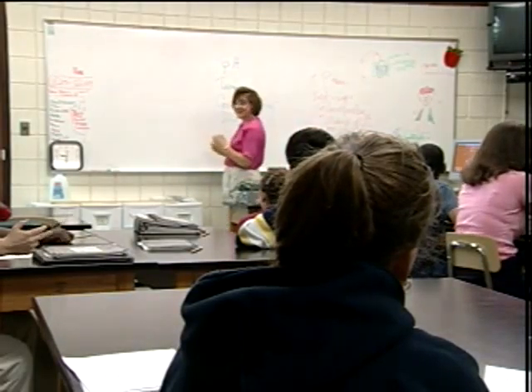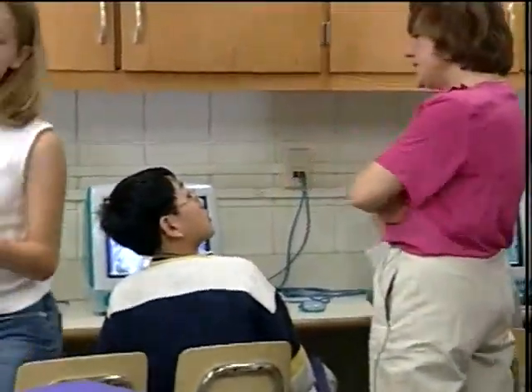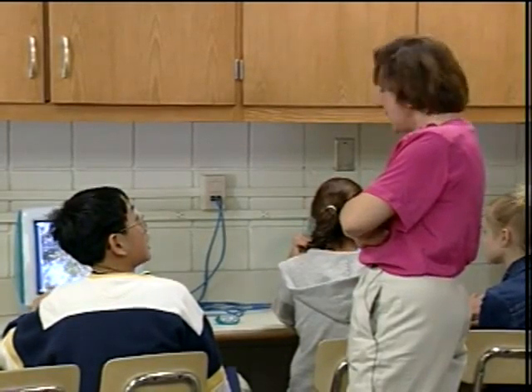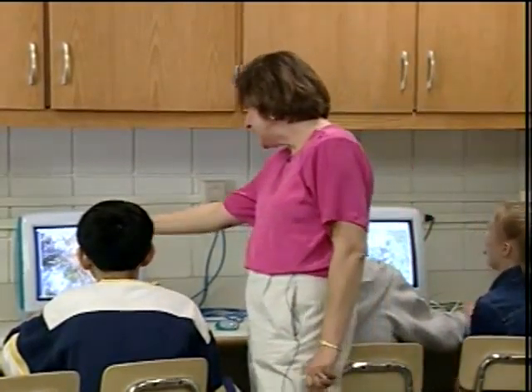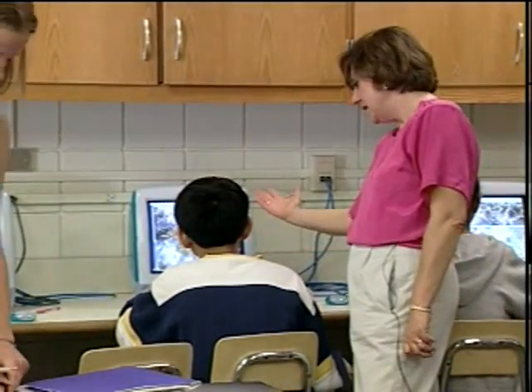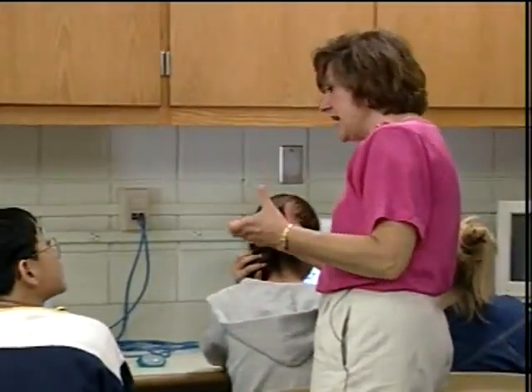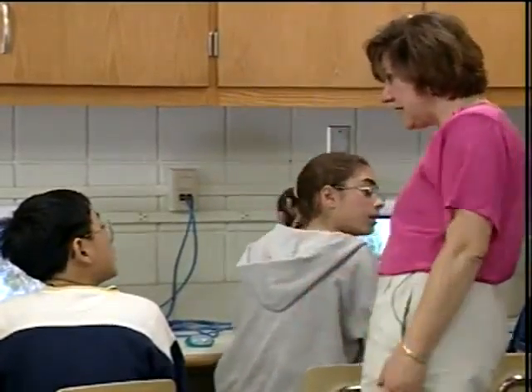DO and turbidity. Okay. Well, do the leaves dissolve, or what do we know leaves do? Leaves rot. Right, they rot, they decompose. Like dissolved particles that go into... Yes, right, but after decomposition. So the only thing that might happen with these leaves are what? If we crunch them up, what might they do? They might add to our turbidity readings, right? Okay, but not necessarily the conductivity, right? Because they're still solids. They have to decompose in order for them to affect other things.